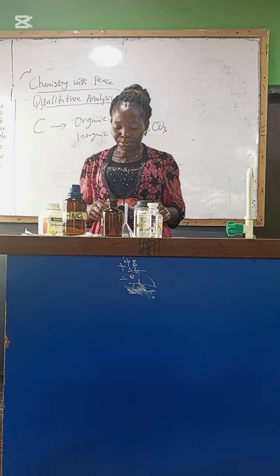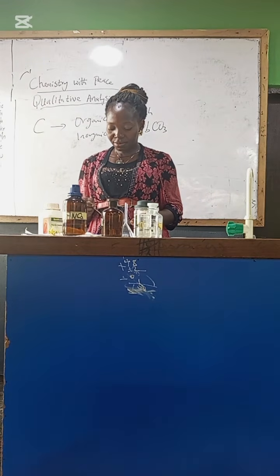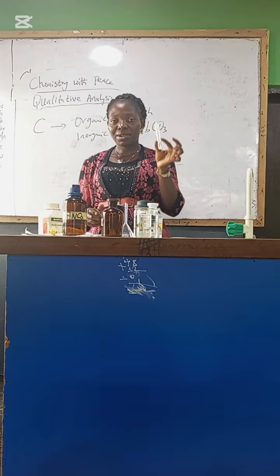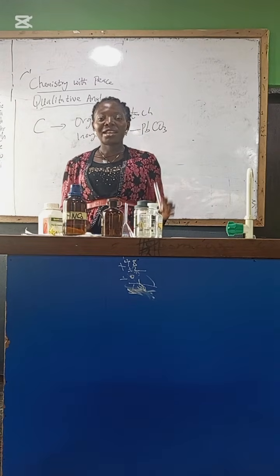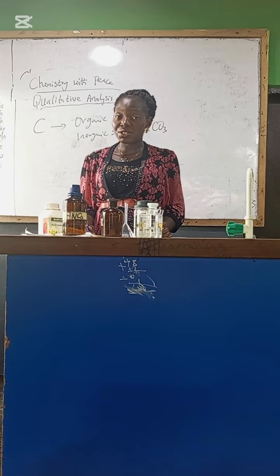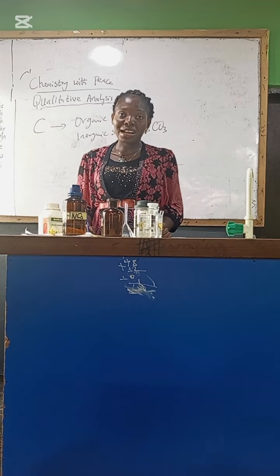Here is our test tube. Then one thing I want you to note is that lead carbonate is not soluble in water. Starch is not soluble in water.